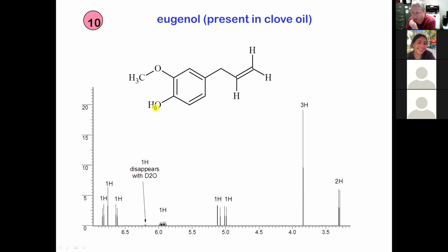The OH. Then we have a weird aromatic region where the only thing we can really see is maybe which one is the singlet. This is the aromatic region here. Which one of these is the singlet? Top, bottom, left, right. Singlet, no neighbors. Which signal of the aromatic? It's the top, yeah. Top has no neighbors, so it's a singlet. And then we have these two doublets. We don't really know which is which, but those are these two ones, right?